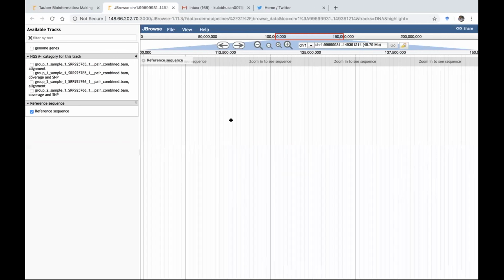Is it okay now? Yeah, Prabir. I think you have already covered the mile, and you have already opened that. Now if you can see on the left panel, the data there, this group 1 sample, 5765 is the cancer sample and 5766 is the normal sample. Now, what if you want to look at what is in the cancer sample? You have to select the checkbox beside group 1 sample _1. Yes. Once you click that, it will, yes.